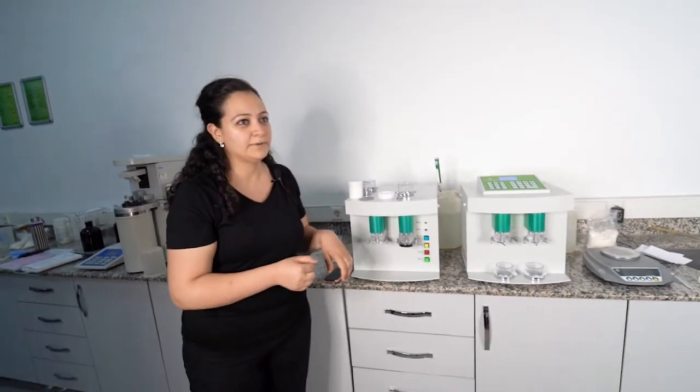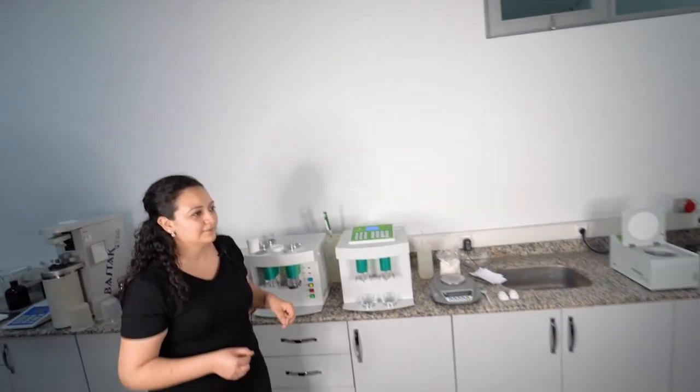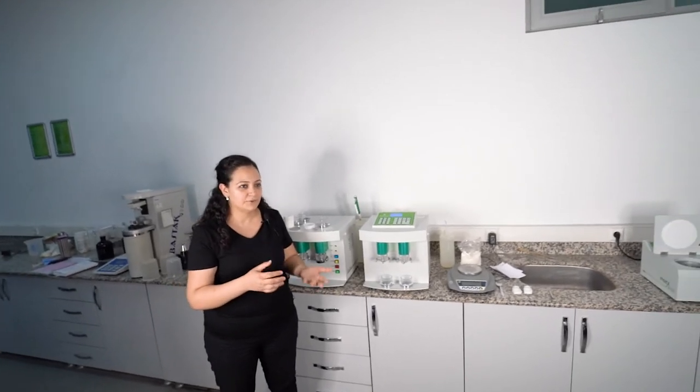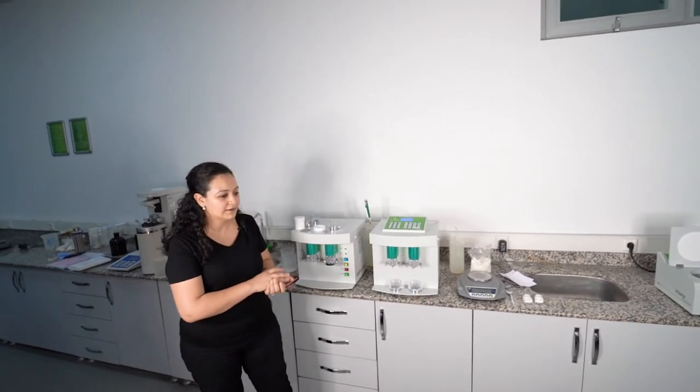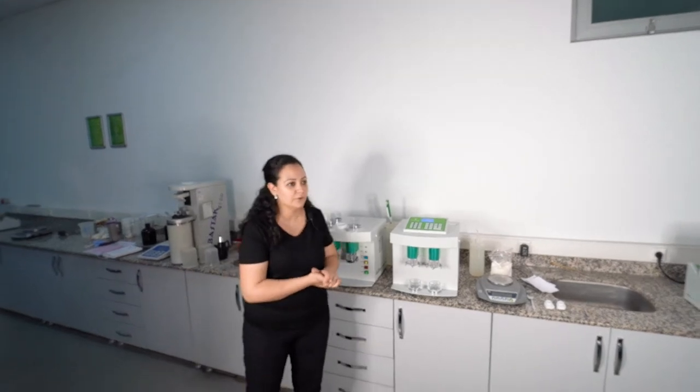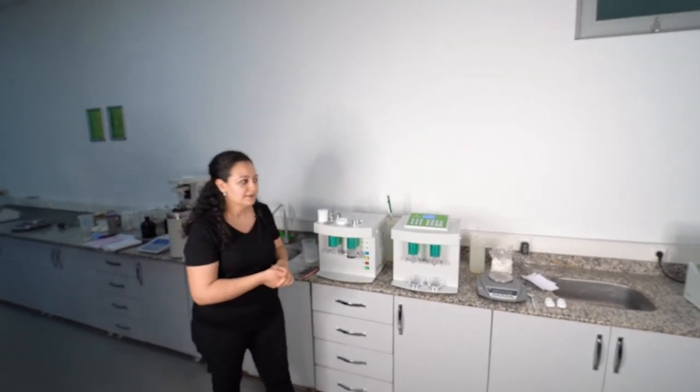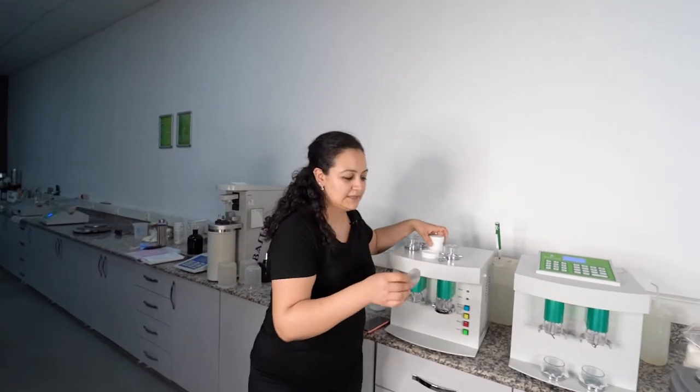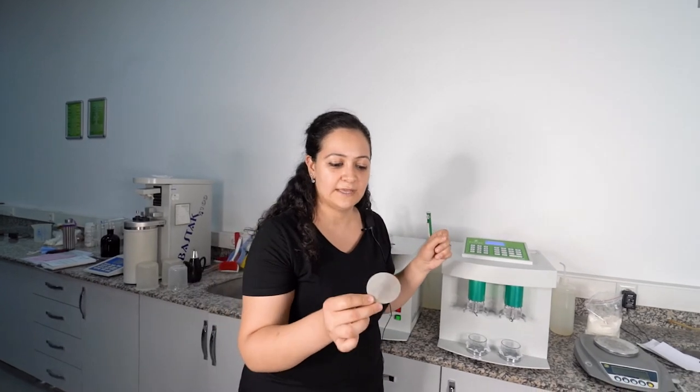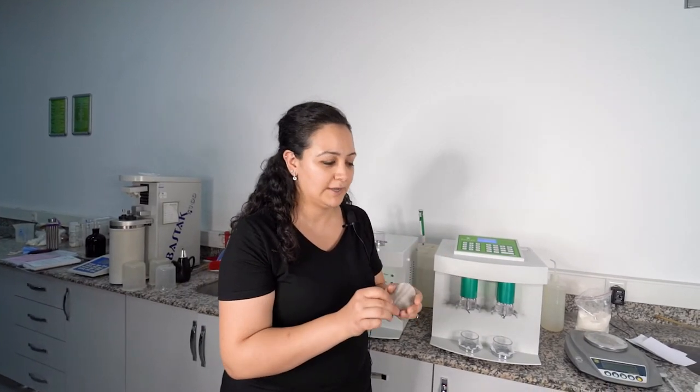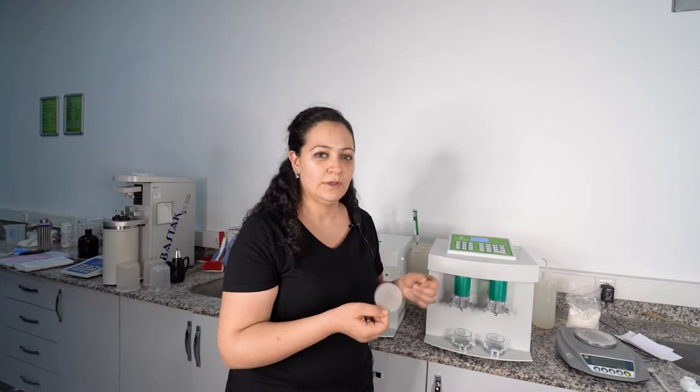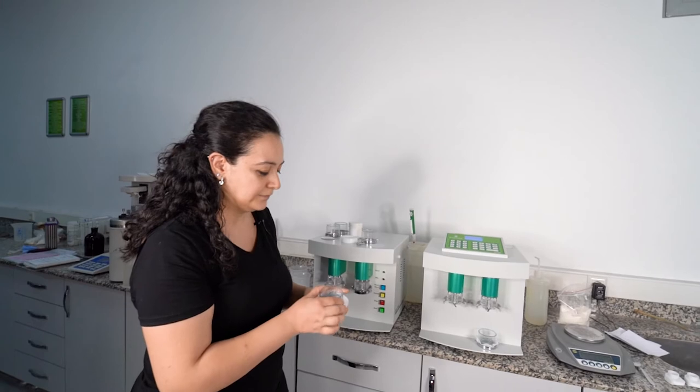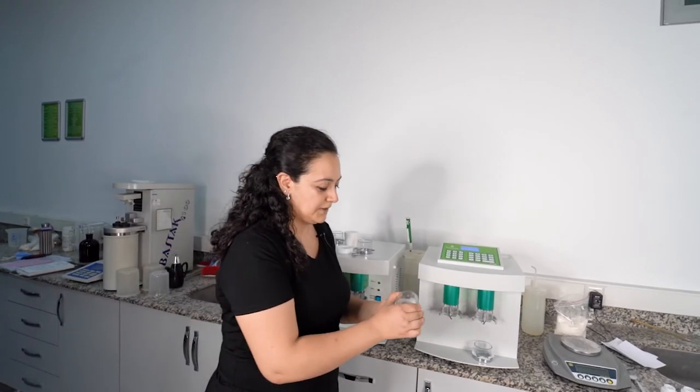In the past, people were doing the test by hand, but it is not so stable result because temperature of your hand can be changed and you cannot measure the water amount that you are using. So this machine makes your results standard. Some people are using metal sieve. If you wish, you can use that kind of sieve. You can provide this one. It is 90 micron. Normally our polyester sieves are 88 micron.